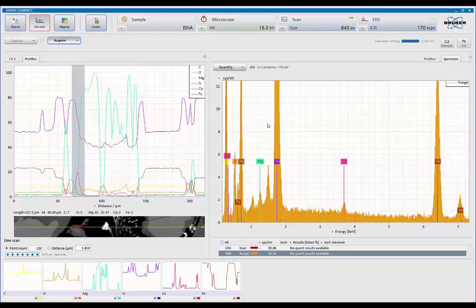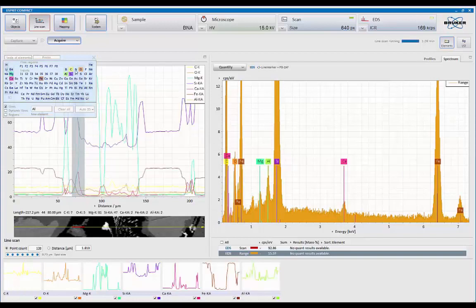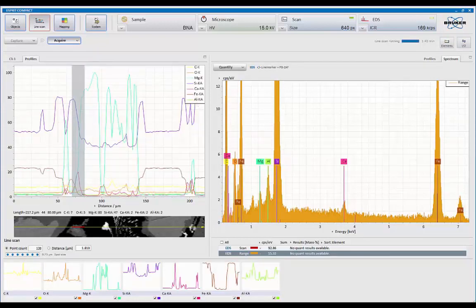like that aluminum peak there, I can simply come in here and say, well, let's add that to the list of possibilities. And immediately it updates the analysis.